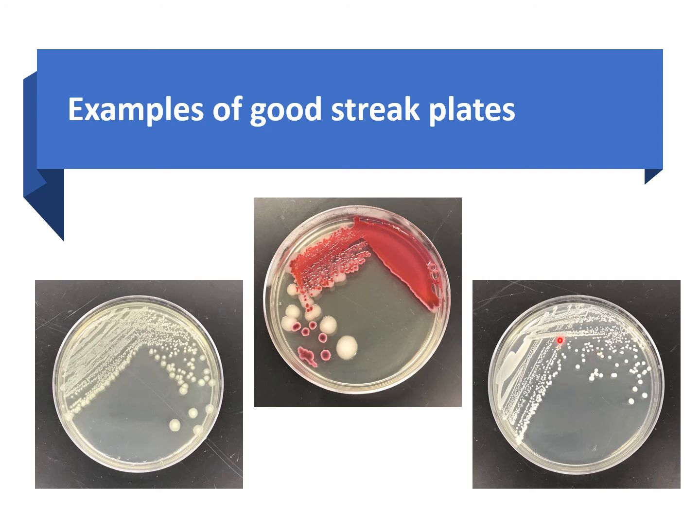And then same thing right here. Here's the first, the second, kind of like they got it already. They achieved those single colonies already in the third quadrant. But as I said, better to do 4 quadrants, okay? Now, see how here we achieved those single colonies that we are after?